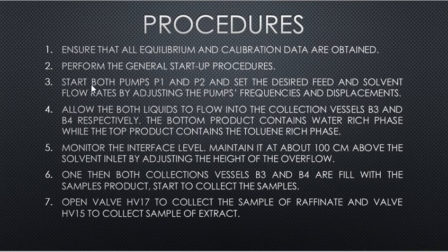Next, we have to start both pumps, P1 and P2, and set the desired feed and solvent flow rates by adjusting the pump frequencies and the displacement. After that, we allow both liquids to flow into the collection vessels B3 and B4 respectively. The bottom product contains the water-rich phase, while the top product contains the toluene-rich phase.